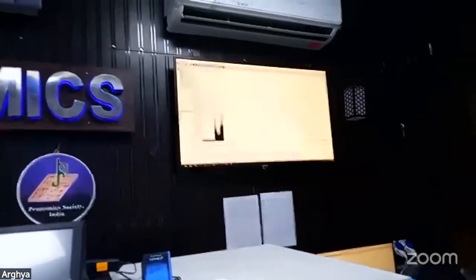This is one of the live runs which are happening. So you can easily find what actually happens during the live acquisition of the samples. The peaks, the m/z for each MS/MS is being detected. We will explain this in great detail in the next lecture.